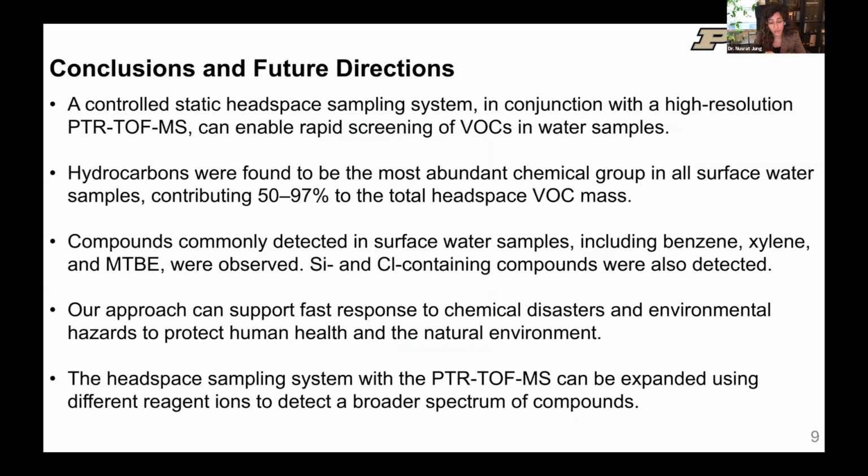So in summary, because this is a short presentation, I want to share that we developed a controlled static headspace sampling system in conjunction with a high resolution proton transfer reaction time of flight mass spectrometer. This is a new technique that can enable rapid screening of VOCs in water samples. It can support fast response to chemical disasters and environmental hazards to protect human health and the natural environment.